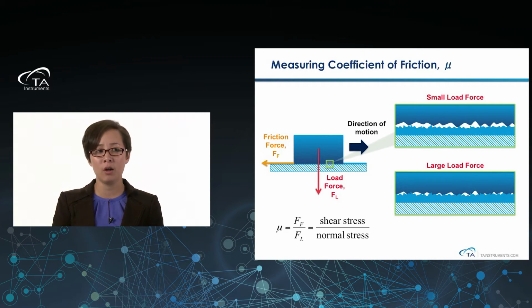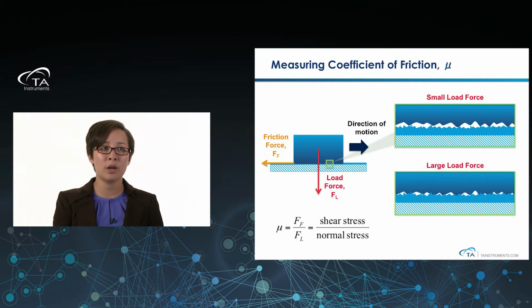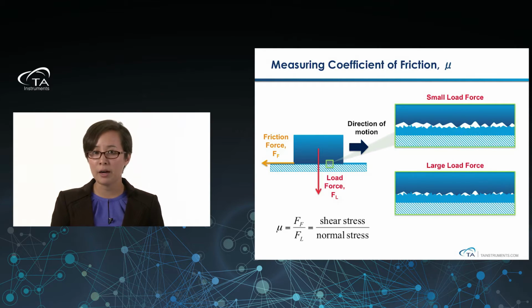Now, if we zoom in on all of these surfaces, on a macroscopic scale, things such as stainless steel or polymer bars look really smooth. But what we're studying with tribology is the interactions on this microscopic scale. If we zoom in between these surfaces when they're in contact with one another, you'll see all of these surfaces are somewhat rough on a small length scale, maybe microns, even nanometers. All these roughnesses in the surfaces are known as surface asperities. Every material will have its own unique characteristic of surface asperities, and it will depend on things such as the composition of the material, and also the way that these materials were processed.